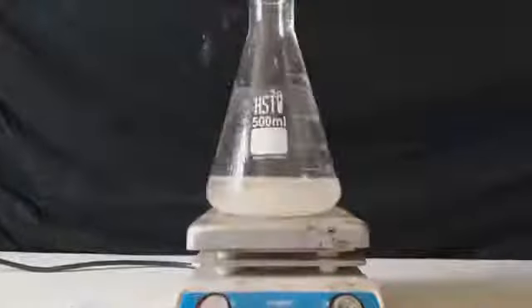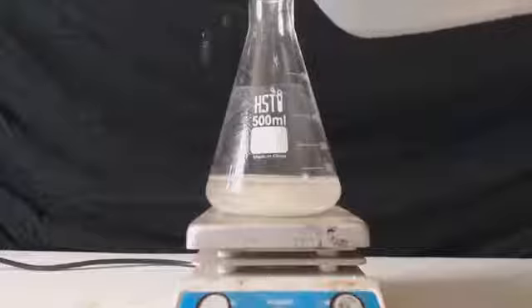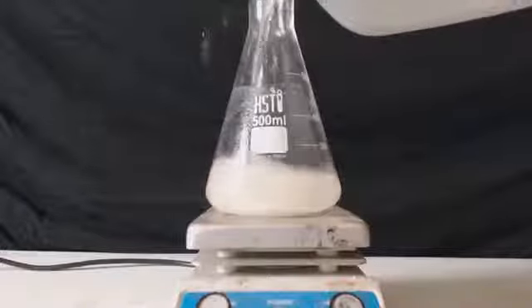I let it stir for a little bit, and it's not very soluble, so I'm going to add a little bit more water and let it stir some more. It's still bubbling. It's been 2 hours total that it's been stirring. As you can see, there's precipitate down at the bottom there, just like a layer. Compared to what I put in, it's nothing, though. So, screw it. I'm just going to filter it.